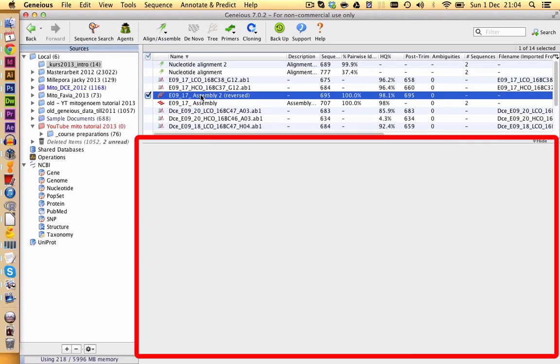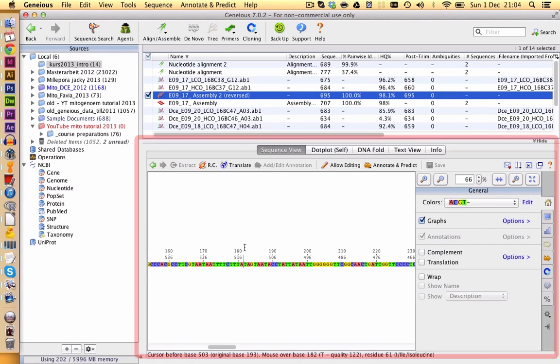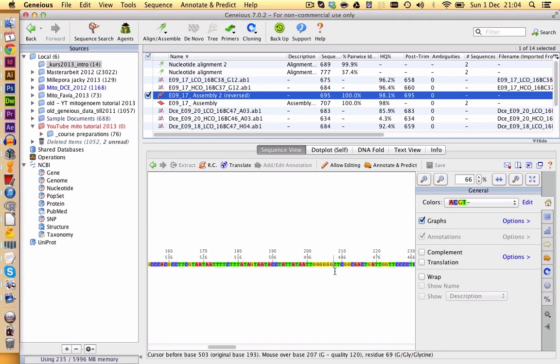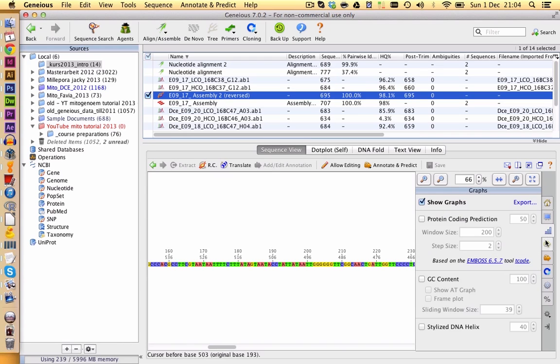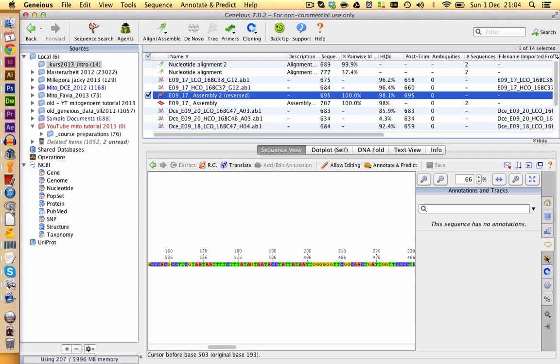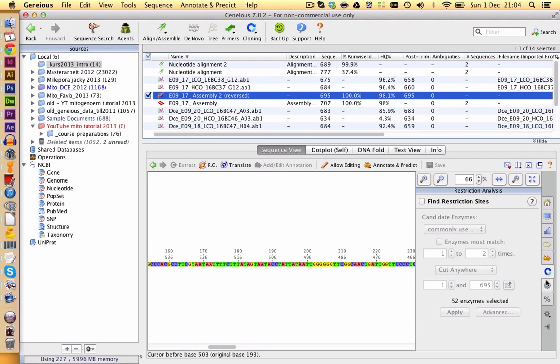Also, I can select different files. The viewer, you will use this a lot to view your files and also to do some editing and so on, and you can manipulate a lot of things with the settings here, so those are the general settings, but you will find a lot of more options under here.